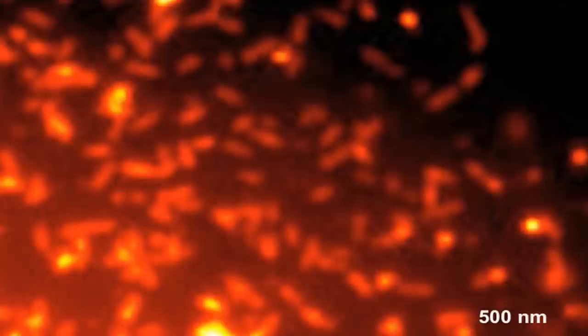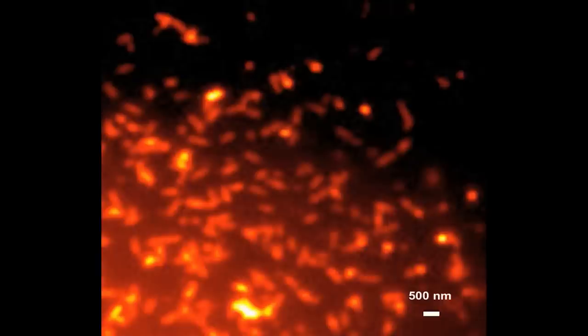On the image we see here, we have a conventional microscopy image of so-called protein fibrils. Fibrils that form in the brains of patients who suffer from Alzheimer's disease. Essentially, there are long chains of proteins which make these hard fibril structures. And this is what you see. You see hardly anything because the wavelength of light limits you in what you can see in a conventional microscope. We just get this blurred mess. We cannot differentiate what the molecules look like at all.